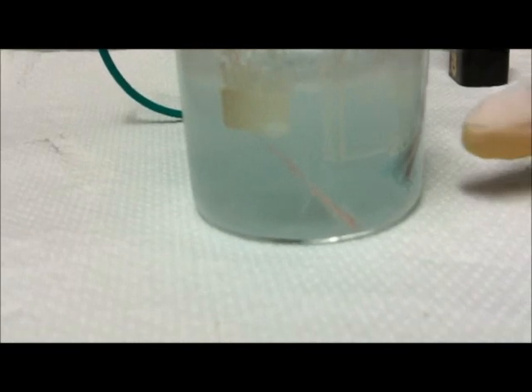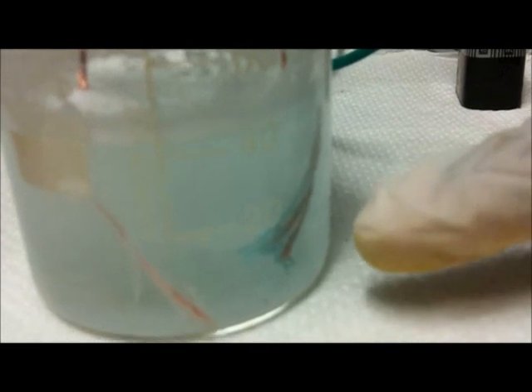On the far right of the beaker you can see a small electrode with a blue deposit on it. That blue deposit is copper hydroxide, that is copper 2 hydroxide, which I'm pointing to at the moment. And here's a much closer view.